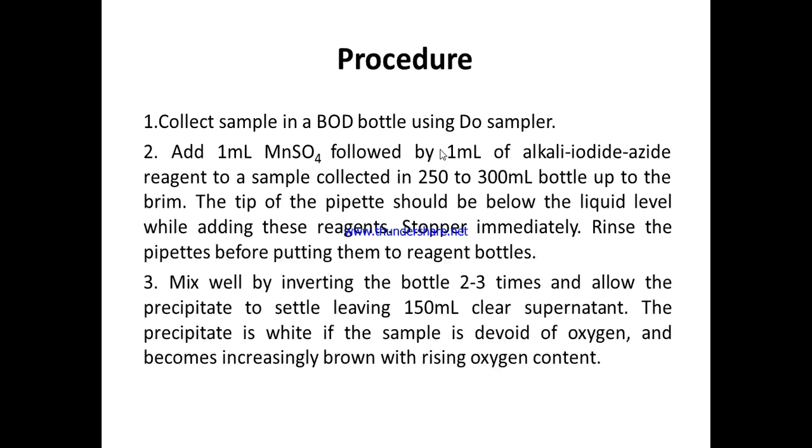We will see that within 30 to 40 minutes there is a clear cut precipitate that has settled down at the bottom. Brown precipitate बोतल के नीचे आप देखेंगे, एक ब्राउन कलर का precipitate सेटल डाउन हो गया. ठीक, and there is a clear liquid above the top of the precipitate. उसी बोतल में ऊपर हम देखेंगे कि एक क्लियर लिक्विड लेयर है, उसको हम सुपरनेटेंट भी बोलते हैं. सुपरनेटेंट क्या होता है? It is the liquid layer lying above the insoluble solid precipitate.